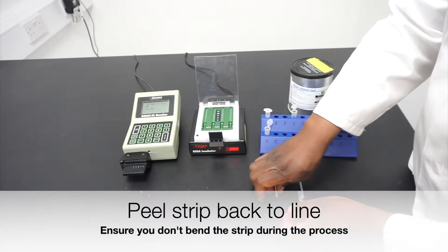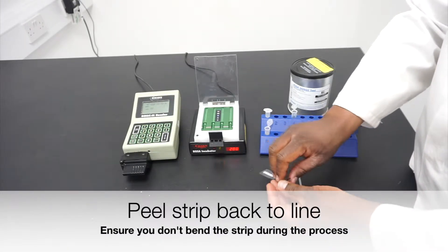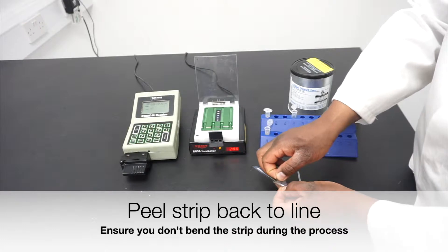Carefully peel the strip tape to the marked point, ensuring that you do not bend the test strip.